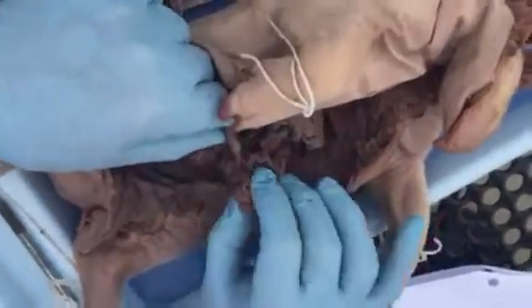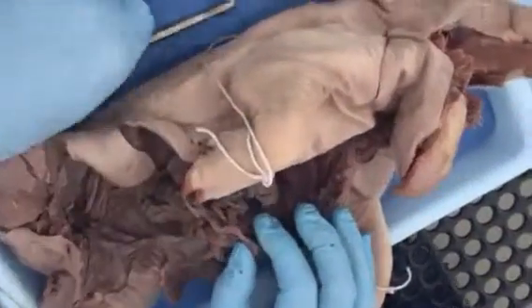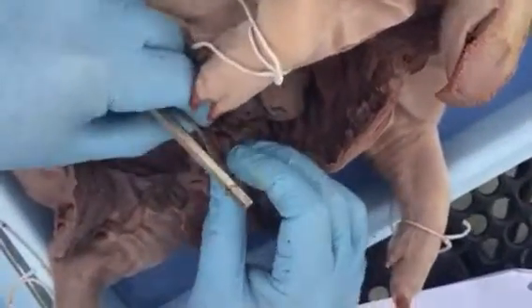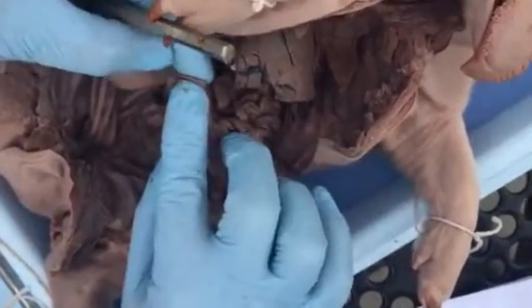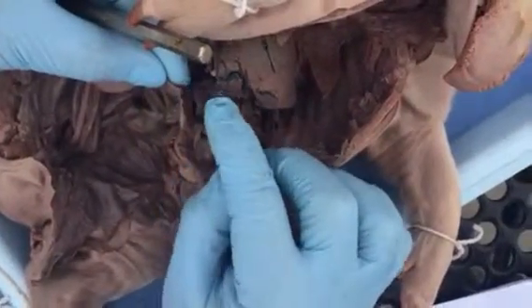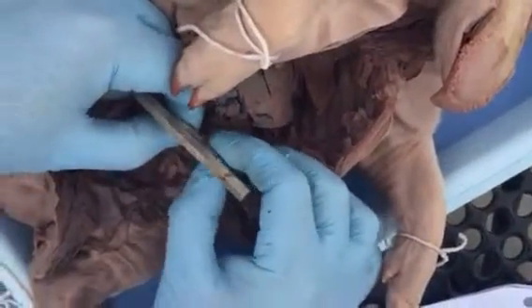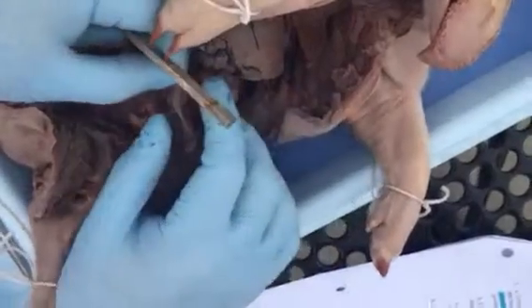And you got to find where the large intestine begins to find the last region of the small intestine. So here's where the large intestine begins. So that little piece would be the cecum? Yeah, that's the cecum right there. It's a blind pouch, and in us, that's where the appendix shoots off. So right here, what I'm holding now here is the last part of the small intestine. That's the ileum. Okay?